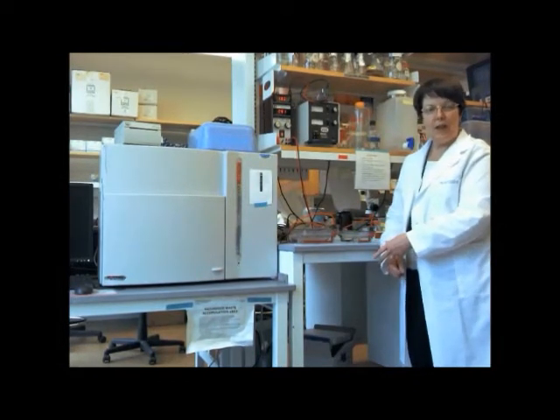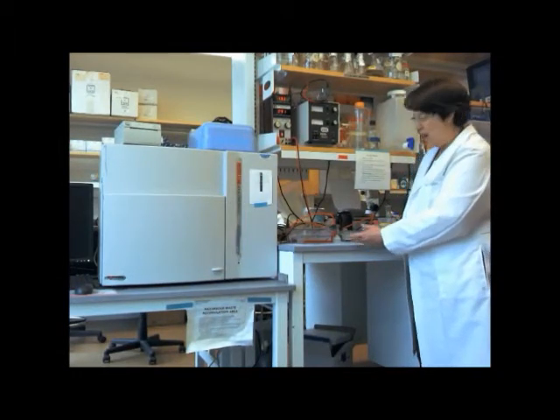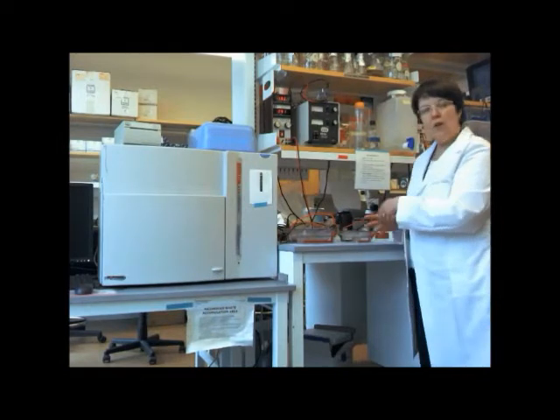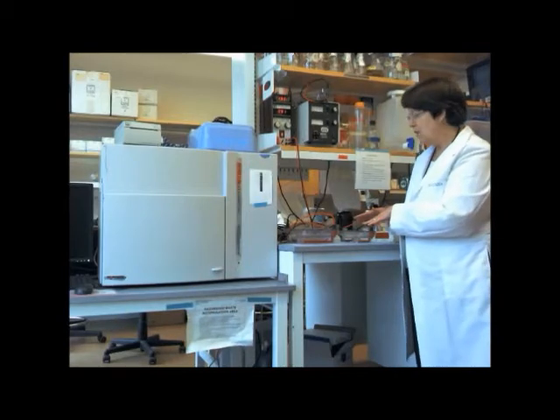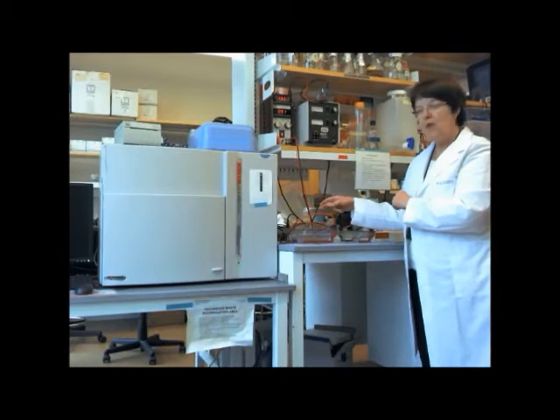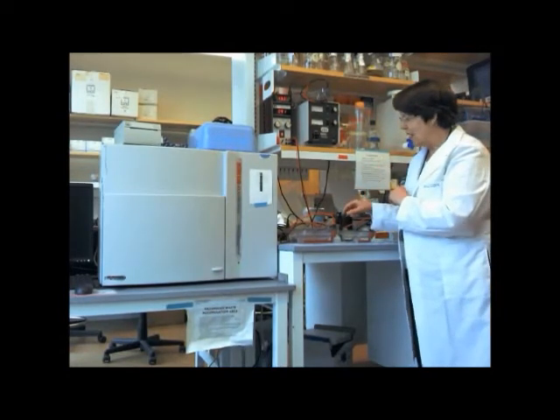I'm going to set up a station for your field trip where you're going to see gel electrophoresis of DNA molecules. And so this is an area where we run gels in these gel apparatuses. So you're going to get to see a gel, actually feel what a gel feels like, and then we'll practice loading a gel because you have to load the samples in these tiny little wells. So you get to try doing that yourself.